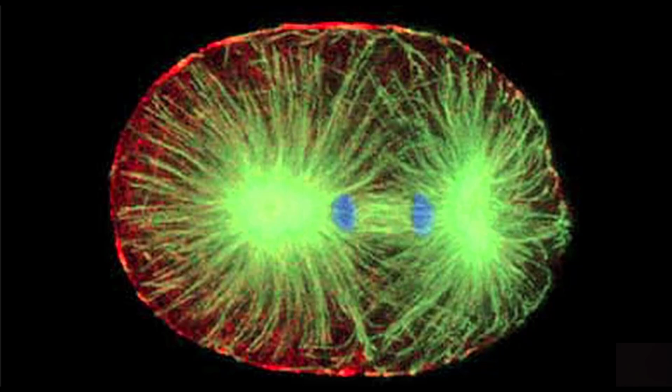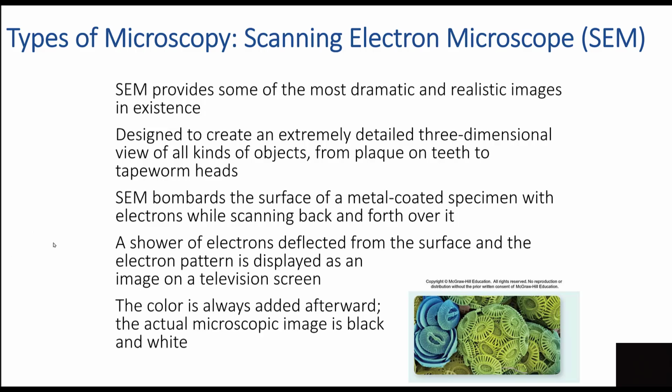It's amazing. We see the DNA, and this of course is a very powerful tool to use. Now we're going to switch gears and move away from different frequencies of light or UV or various things. We're going to move now to electrons, and now we're going to use an electron gun with various different types of power. The first one we'll talk about is scanning. Scanning is not as high powered as transmission, but it's amazing what we can do with it.